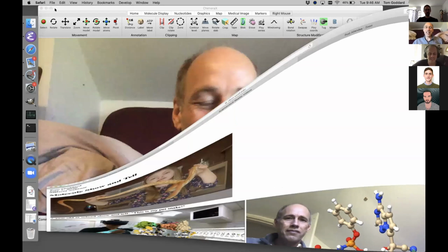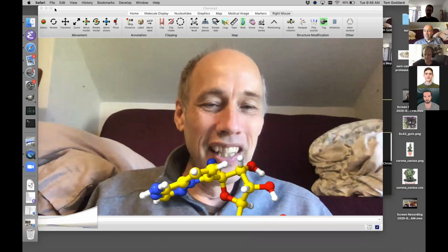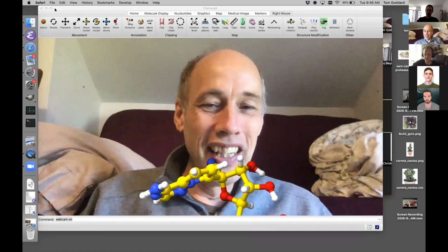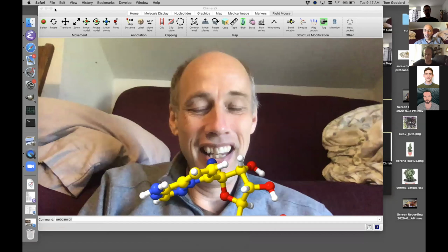Are there other questions? There's one question from PA in the audience who can't unmute. Does the webcam interface work on the Windows builds for ChimeraX too?